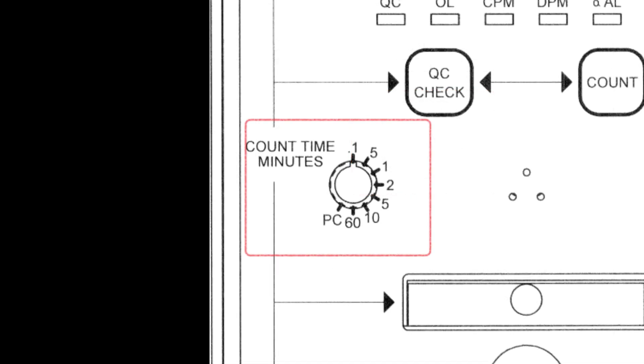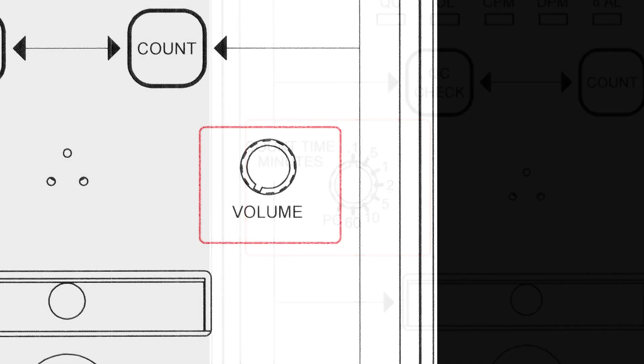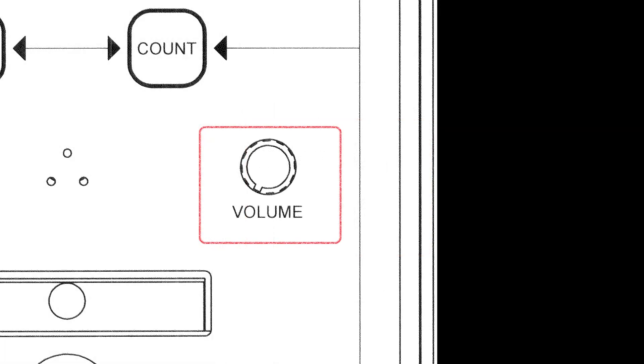A count time rotary switch that allows the selection of preset count times or a PC position that selects the user defined count time. A volume knob that varies the audio output.